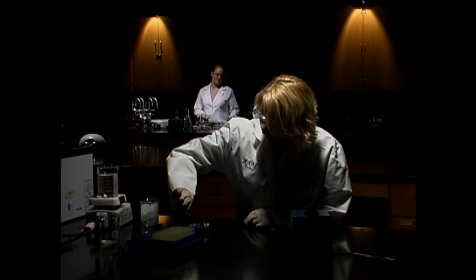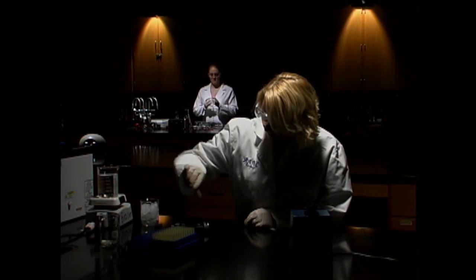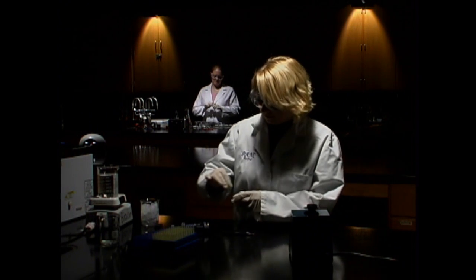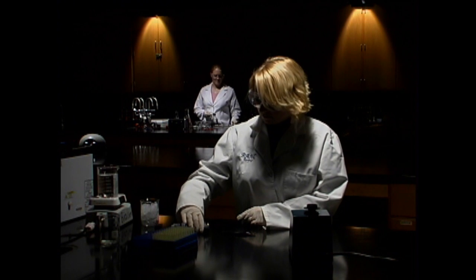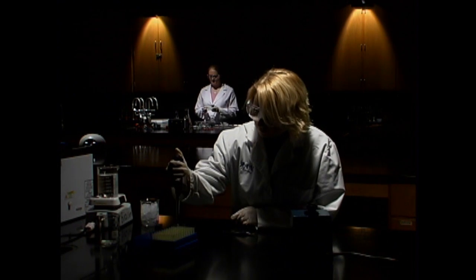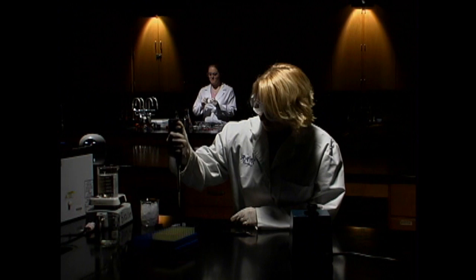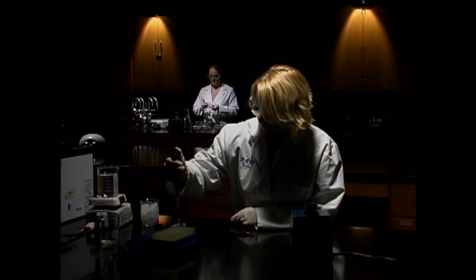Place the hairs in the bottom of a 1.5-milliliter screw-top tube. Obtain a lysis solution and mix it by pipetting it up and down. This solution contains hydrochloric acid to adjust pH, proteinase K to digest proteins, and a chelating agent to remove magnesium.